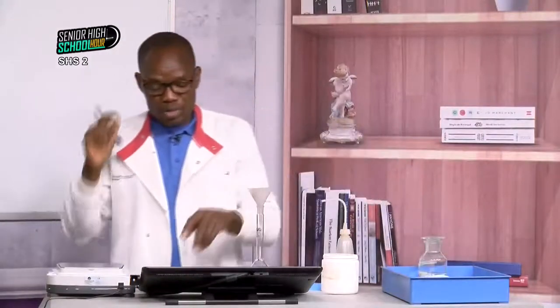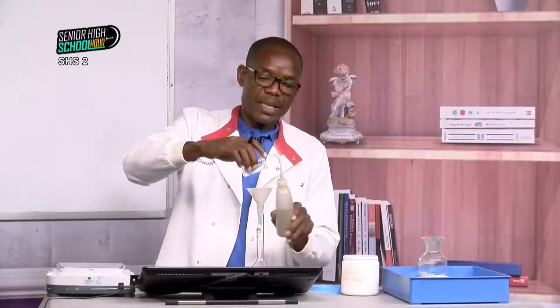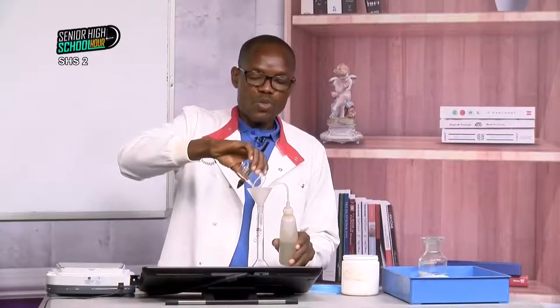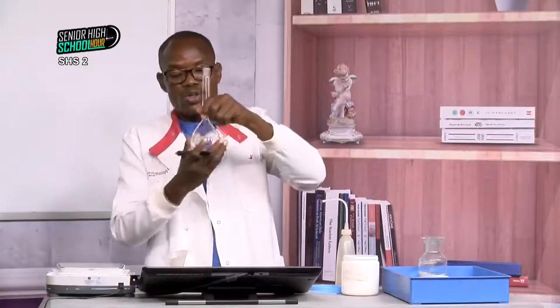Please take note, you can also do the transfer directly without dissolving the solid substance. After weighing, you just use water to wash the solid substances down directly like that. That way too, you'll be very fast at your work. Then you swirl the flask so that the dissolution takes place in the volumetric flask. If you are using a 1 dm cubed volumetric flask, it is bigger than this, so we can do it like that so that it will not be too heavy in your hands.